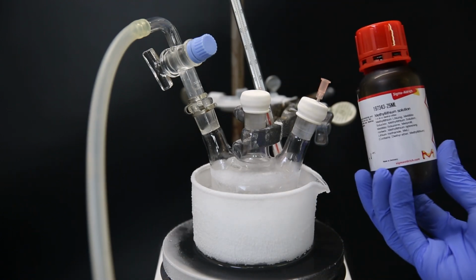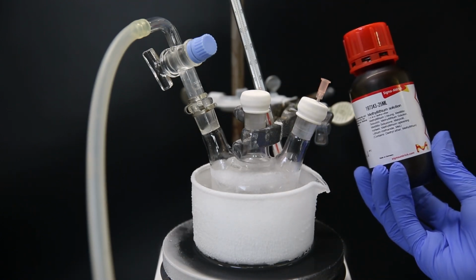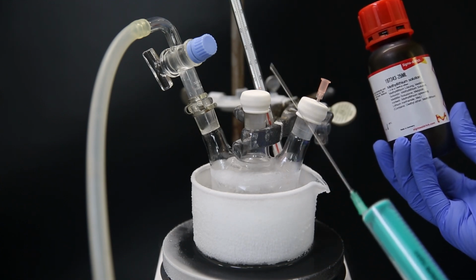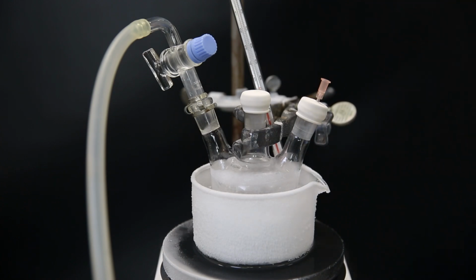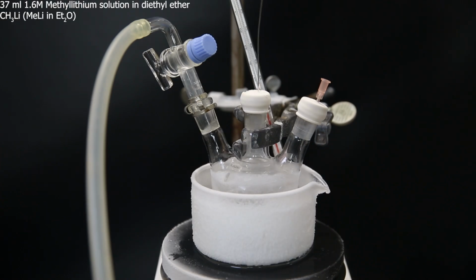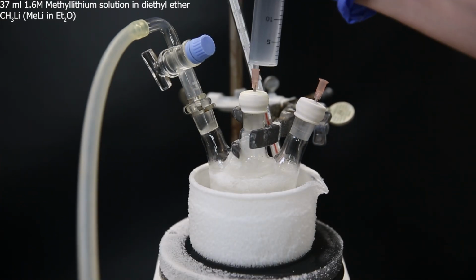Now the only reagent that is needed for this reaction is methyllithium. It comes as a 1.6 molar solution in ether, which I have to take up with a needle and syringe, because it is pyrophoric, and therefore only comes with a septum cap. So over the course of about 15 minutes, I inject 37 ml of the methyllithium solution into the flask.